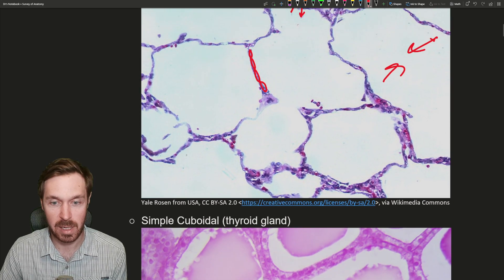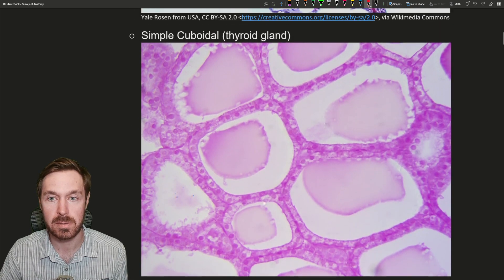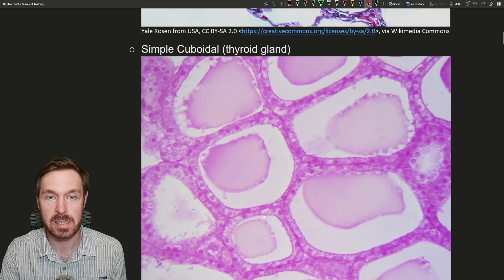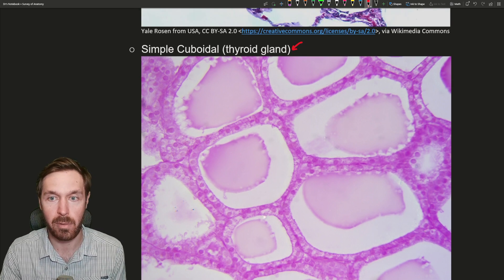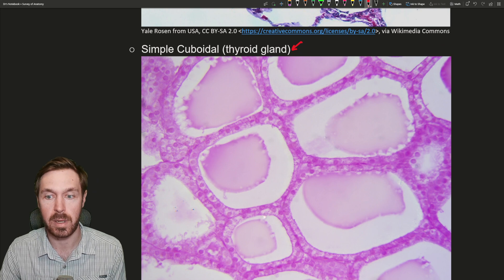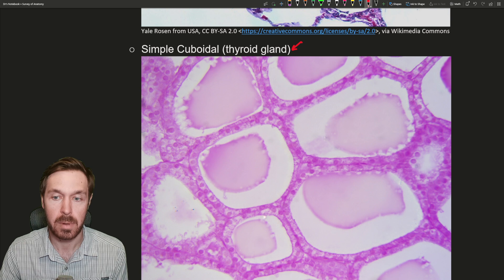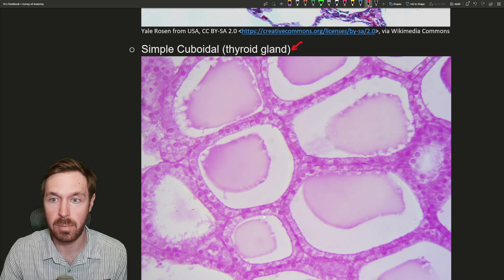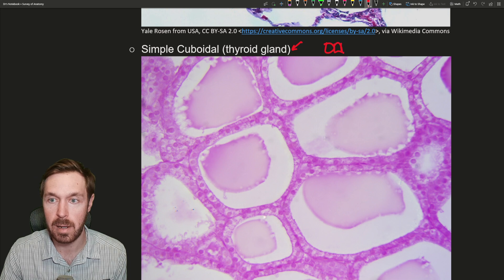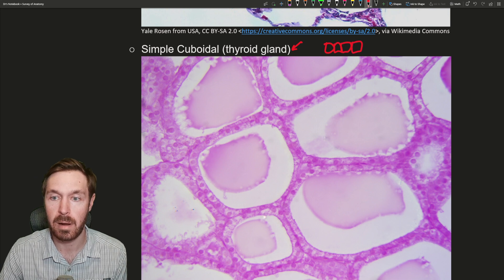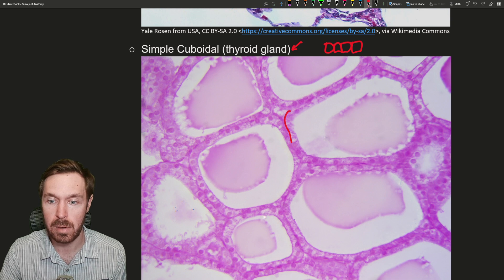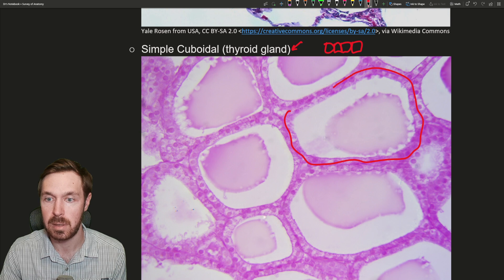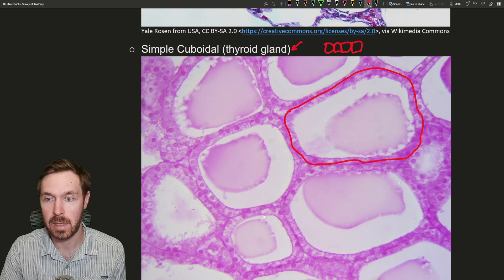This is the one image I didn't take — the rest are all ones I took on classroom microscope slides. Next up is simple cuboidal, from the thyroid gland. What are we looking at here? We haven't gone over the thyroid gland yet, but for simple cuboidal, we're looking for a single layer of cube-like cells. When we look at the structures in the thyroid, we're looking at these little follicles here.